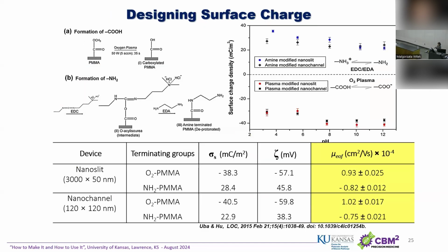So I put a lot of attention on carboxy functionalities that give you the ability to create a surface that's either neutral, or if you go to high pH, above 5, negative. But you can turn the tables, and actually attach an amine molecule, and at that pKa or pKb value for the base, you can turn it around and make it either neutral or positive.